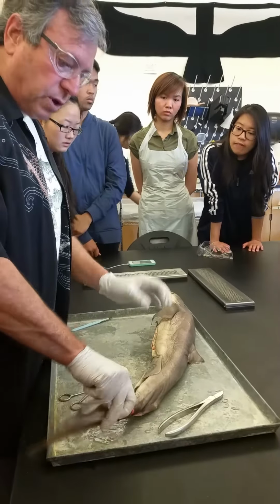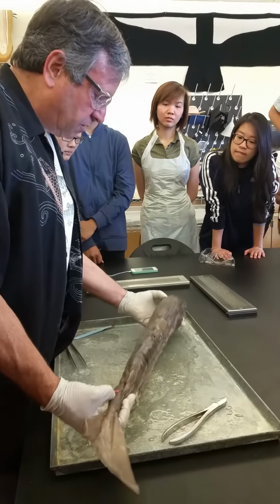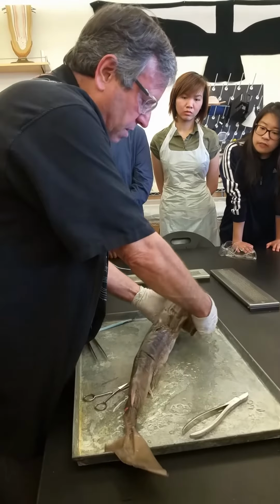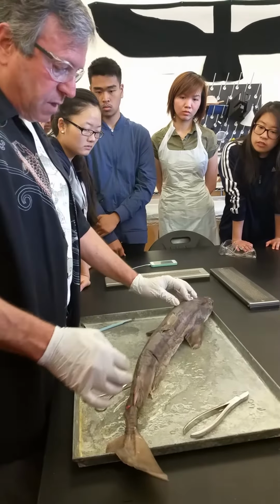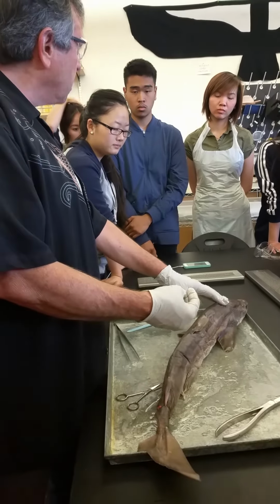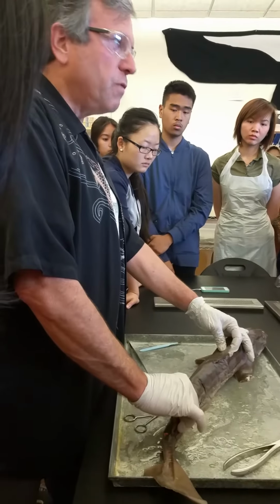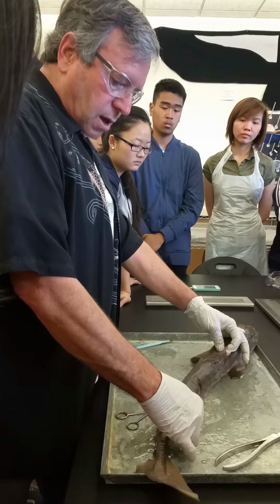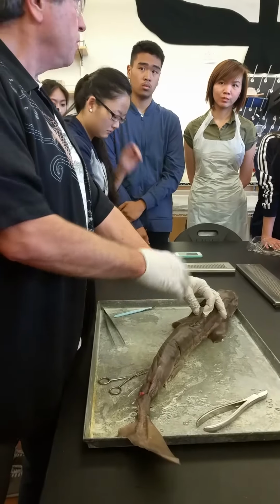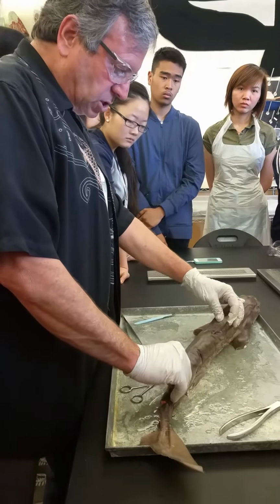So again, we do have a streamlined body for moving through an aquatic environment. But the analogies are rather interesting because embryologically they're very different. For example, we do have the paired and unpaired fins, but they develop from different structures embryologically. And the support structures are different. And they don't have a fin fold. They developed the unpaired fins separately. And so it's really kind of interesting that we end up with so many similarities, yet different developmentally. And so we're talking about analogies in that way.